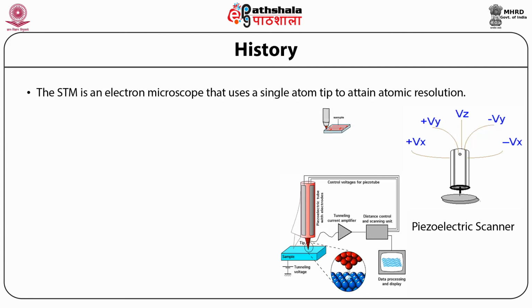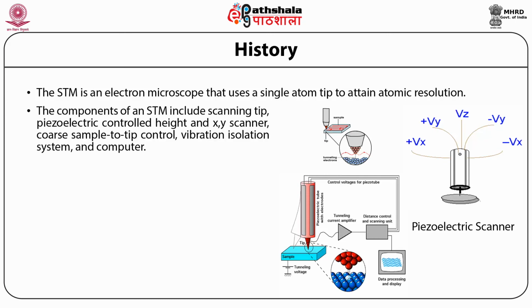As shown in the figure above, which shows the various components of STM, the components include the scanning tip, piezoelectric controlled height and XY scanner, coarse sample to tip control, vibration isolation system, and computer.